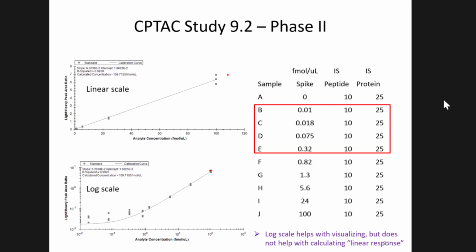Right, so if the digestion isn't complete, then we would have less recovery and the signal would be lower. So we put in more to make sure that we would be able to see the peptides coming from the protein.